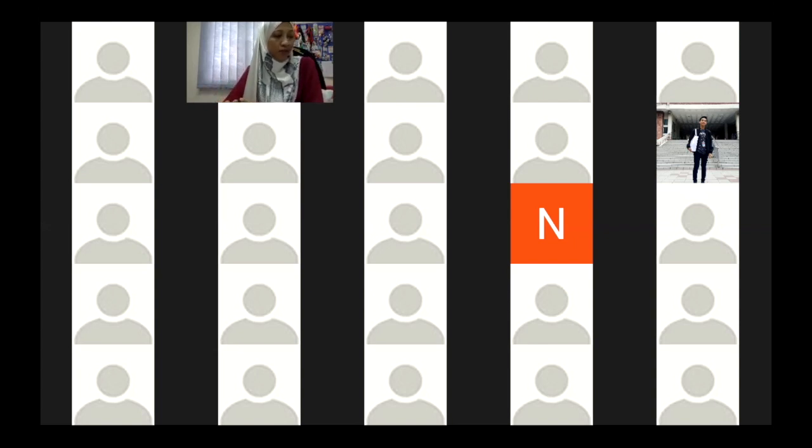What is the flow rate? What is the gas that should be used as carrier? Right? Okay, that's among the things that you need to list. Don't worry. Usually when you go through a paper discussing GC analysis, all of these things are usually listed in one paragraph of the methodology.